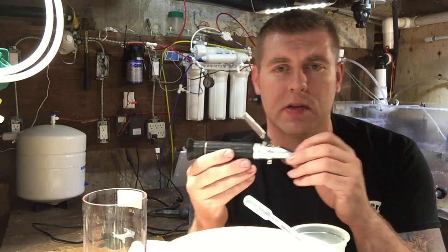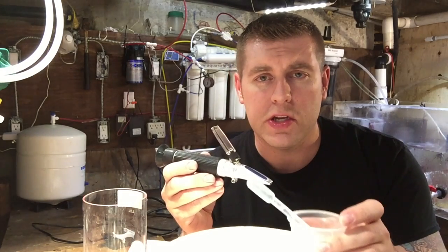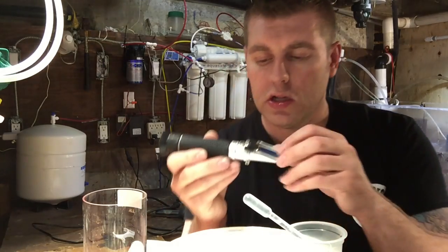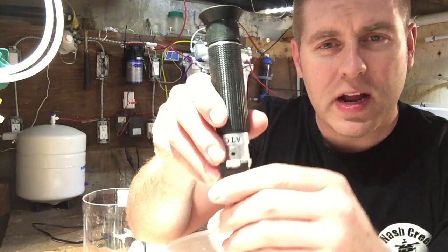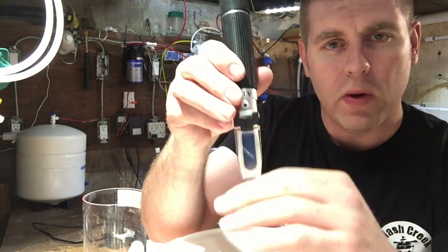Usually when you buy it, they'll put a sample of distilled water in the box. I have some distilled water here — this is what you use to set everything at zero. There's a little screw right at the top; this is how you calibrate it. You're going to see a blue scale and a white scale when you look through the eyepiece.